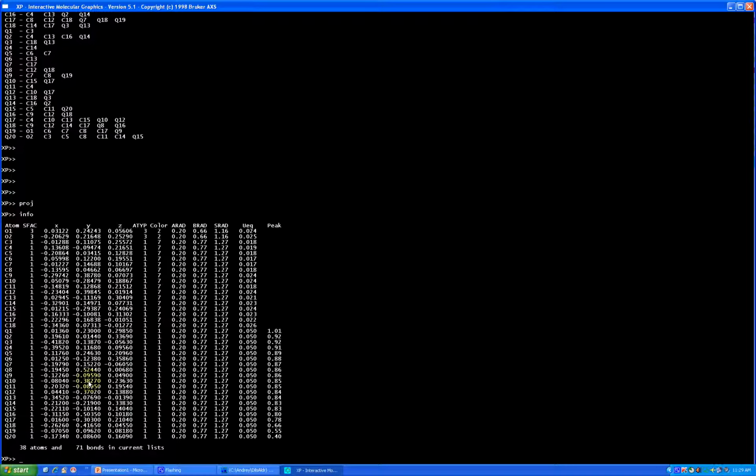You can see they are approximately around 20 for all the atoms. It indicates that you probably don't have any disorder, which is quite good. Okay, now Q1 is the highest peak, it's about 1 electron per cubic angstrom, so let's see where it's located.